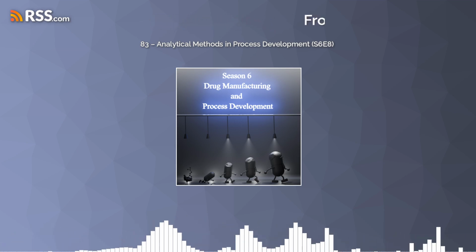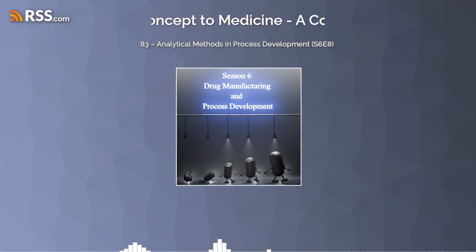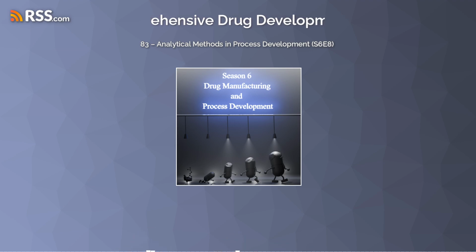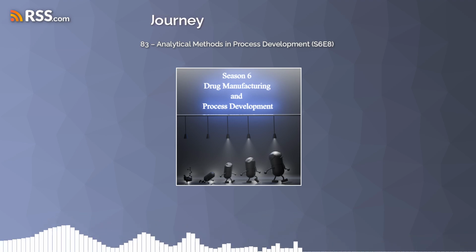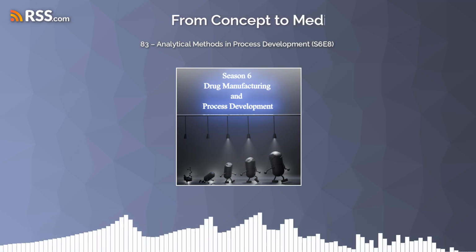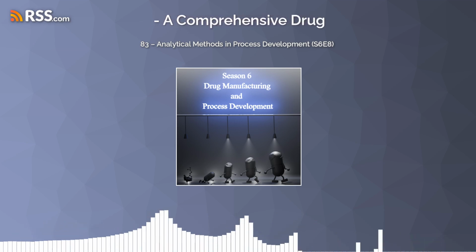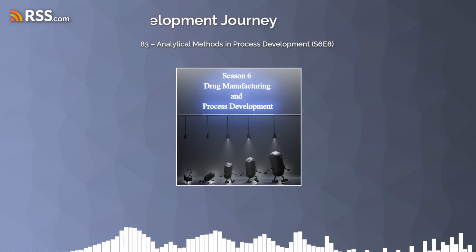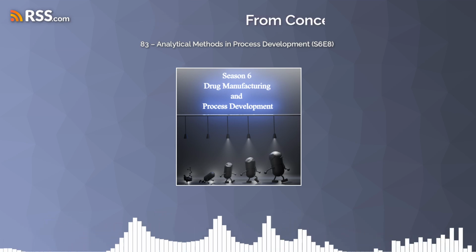Right. And continuous flow benchtop NMR actually integrates NMR spectroscopy directly into these flow chemistry setups. You can watch as the reaction's happening. Yeah, you can monitor it in real time as it's flowing through the system. You can see the molecules transforming. Exactly. It's really remarkable. That is really cool. And some of our OPR&D sources highlight that flow chemistry itself can be really advantageous for certain types of reactions like photochemical syntheses or hydrogenation. Right, where you might need to precisely control the exposure to light or hydrogen gas. So you're coupling that with the power of NMR. Yeah, it's like having a window into the reaction as it's happening.